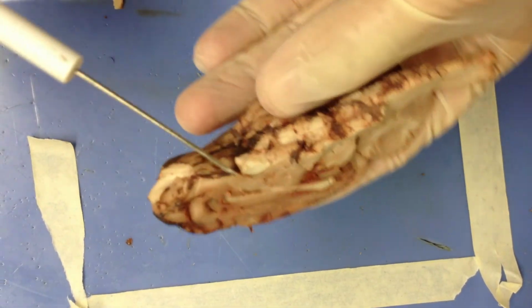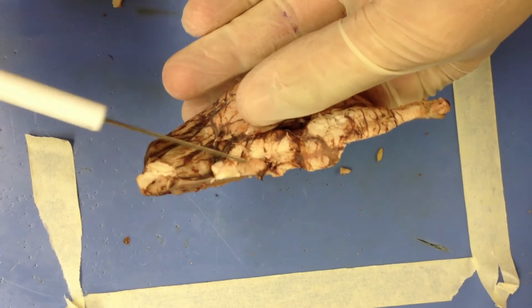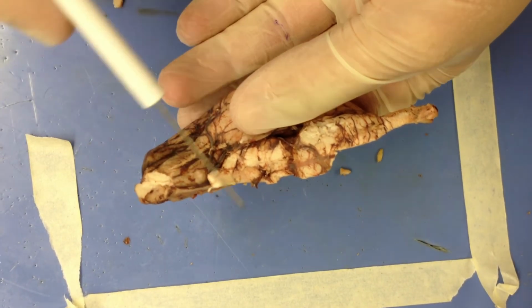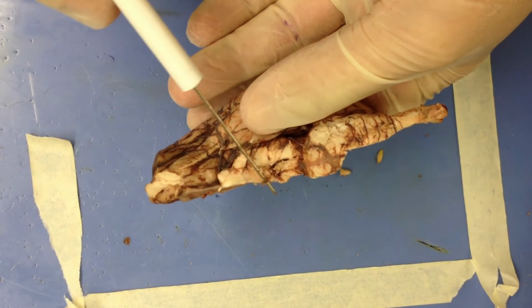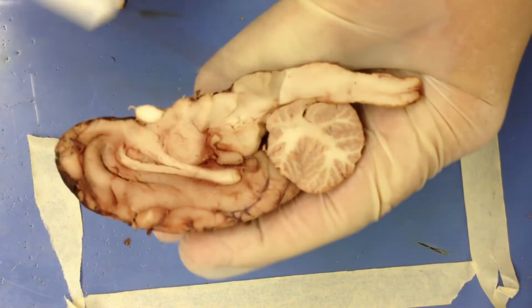The optic chiasm is the piece we were talking about earlier. Here's half of it right here. It's the X that goes across the middle, the optic chiasm. Takes you down into the mammillary bodies. And then the pons is going to be right here.